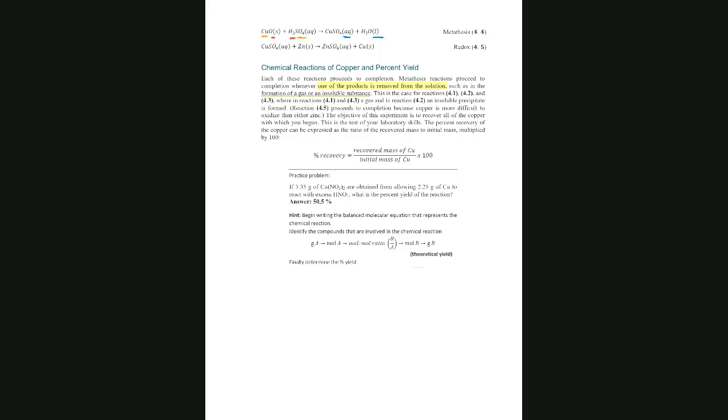So what do we observe? Well, if you were in the lab, you observe that the black precipitate of copper oxide disappears and a blue solution forms. Yes, thank you, Douglas. Exactly. A blue solution forms. And we have now copper sulfate, which is this, in a beaker. And it's a solution, no more solid.